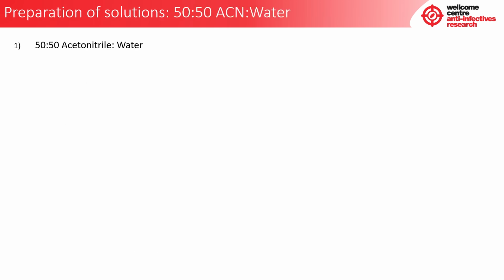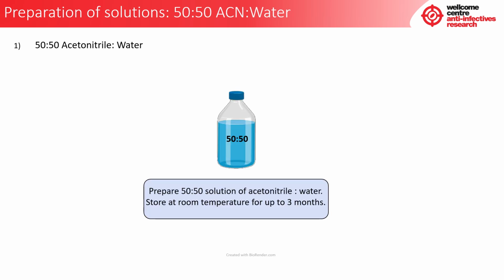First, we're going to prepare our solutions. The first solution we're going to prepare is our 50-50 acetonitrile water. Prepare this solution and store at room temperature for up to 3 months.